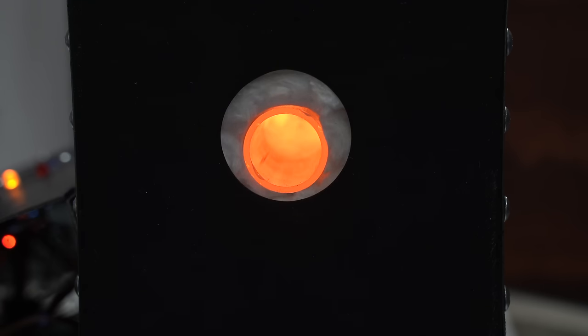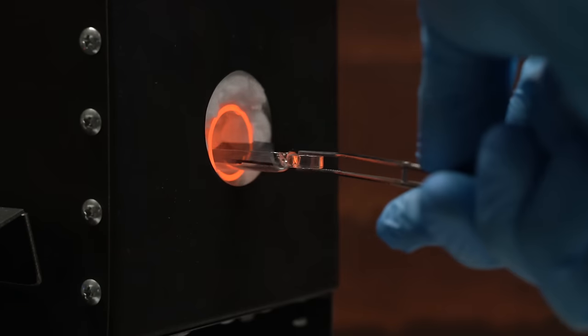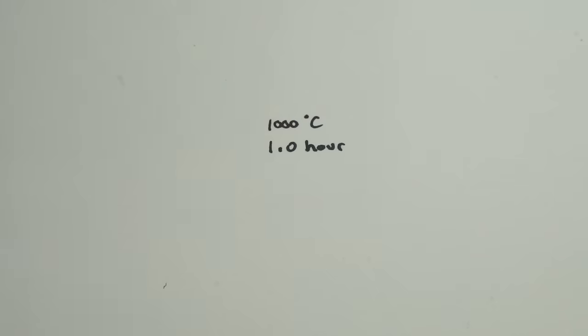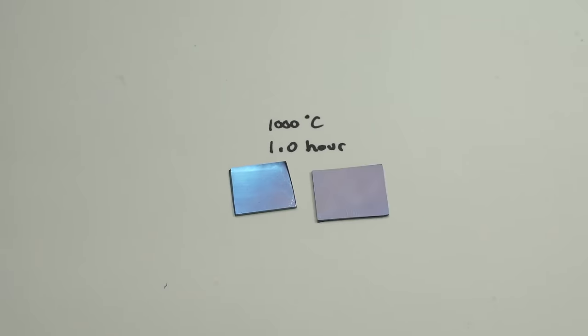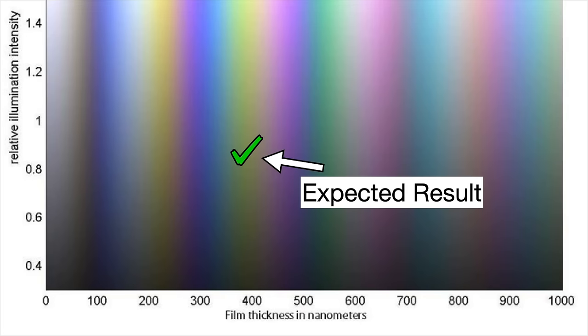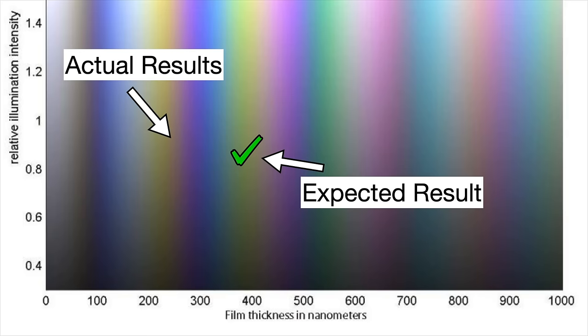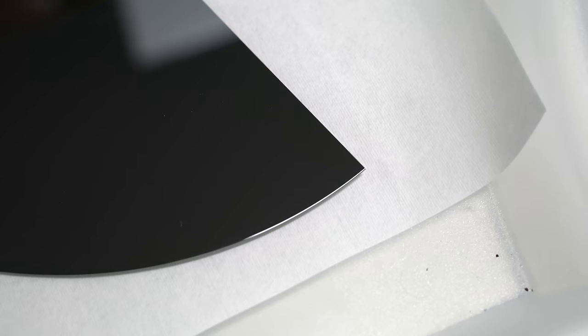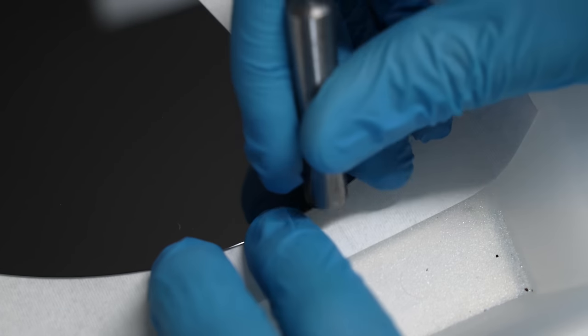I'd put my wafer in at 1000 celsius for an hour, and I'd expect to get 380 nanometers, yellow, but the wafer would come out bright blue or purple instead. I was expecting to get results like this, but what I actually got were results like this.